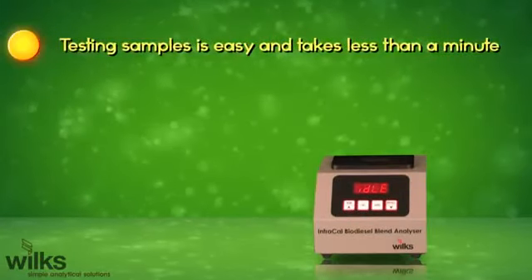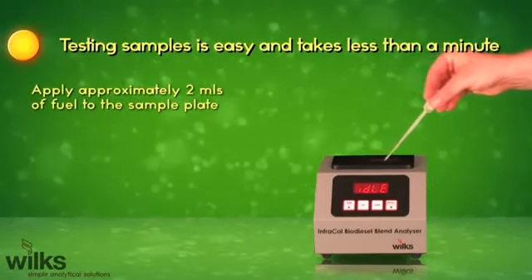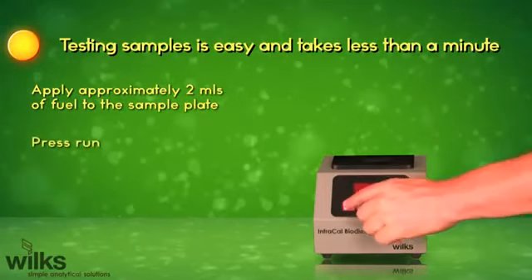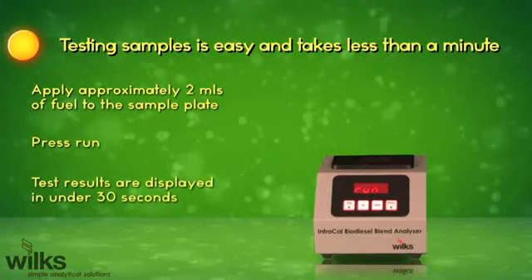Testing samples is easy and takes less than a minute. Apply approximately two milliliters of fuel to the sample plate. Press run. Test results are displayed in under 30 seconds.